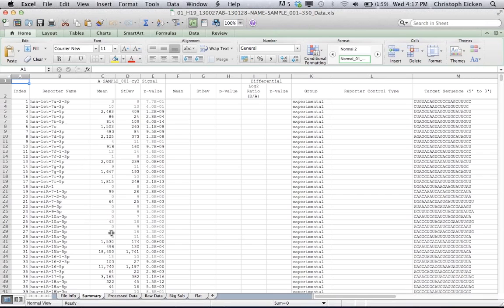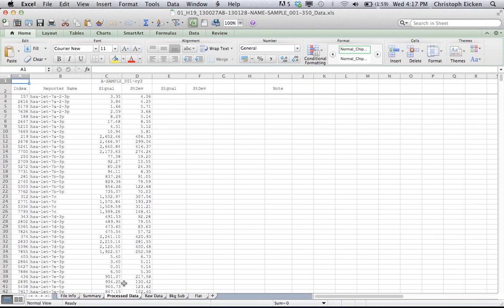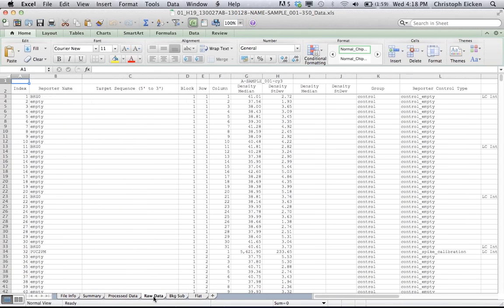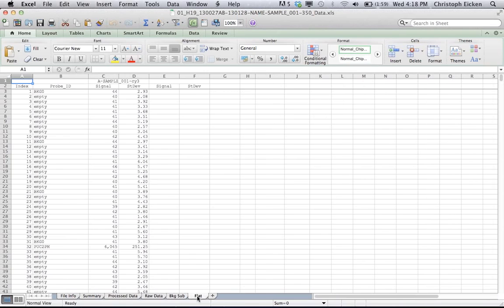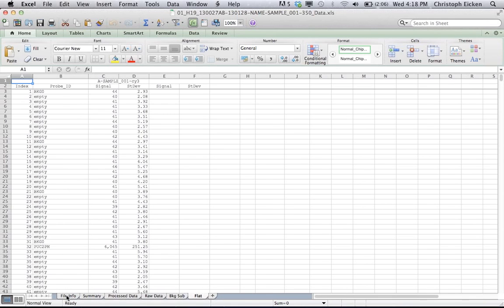So here is already the mean value on the processed data page. It still has the individual values for each of the probe repeats, intensity with standard deviation. And on the raw data page, obviously these are all the raw data. Then background-subtracted data on the next page. And flat, what this means, these are the values that are corrected for the flatness correction.